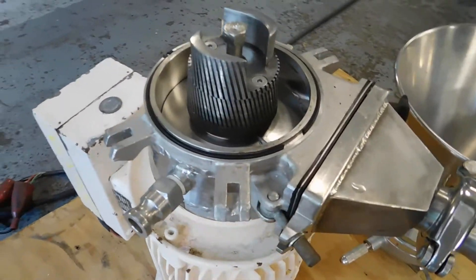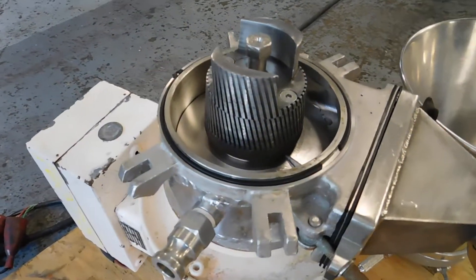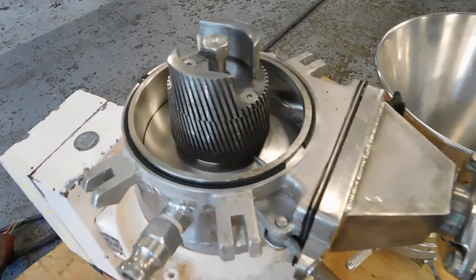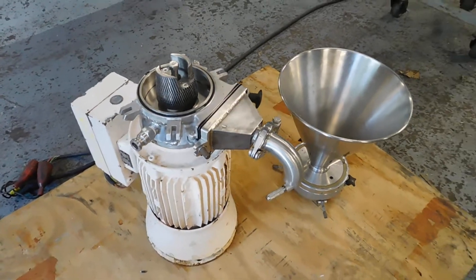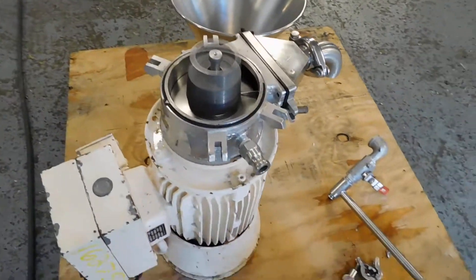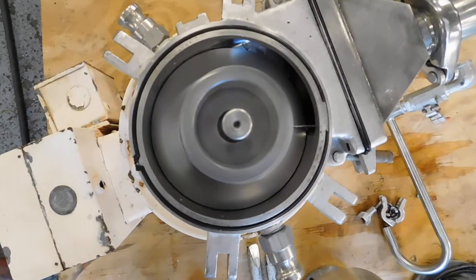The unique element about the Phryma is the tooth colloid mill — it's in three zones as it heads down the body of the rotor: coarse, medium, and fine. We're running on two-phase, three-phase voltage right now to test it, and as you can see, that's what you're looking for right there.